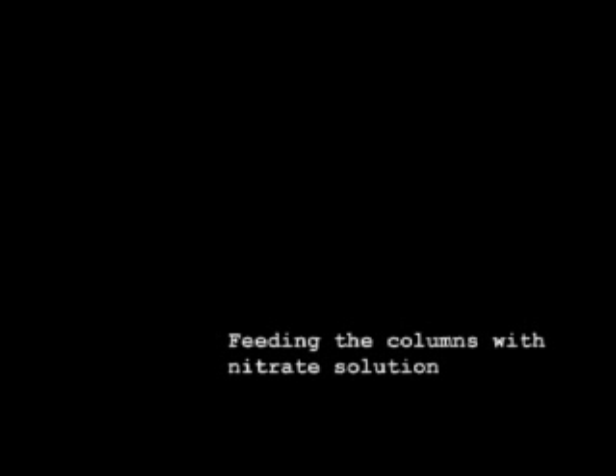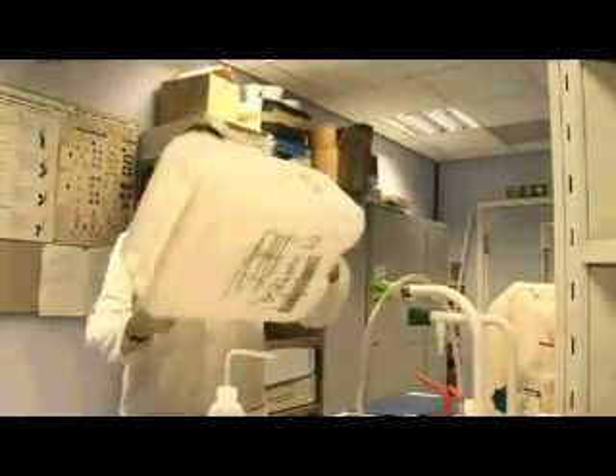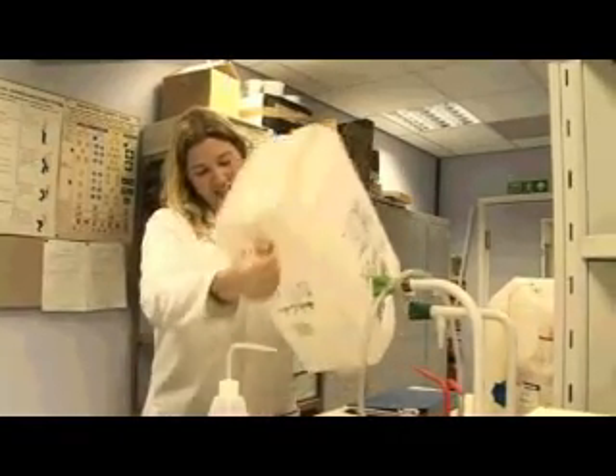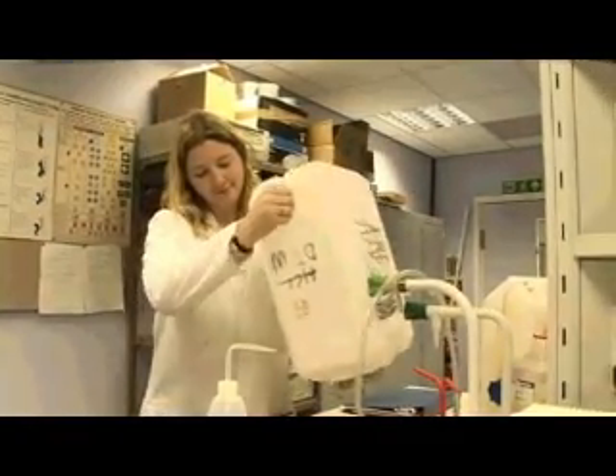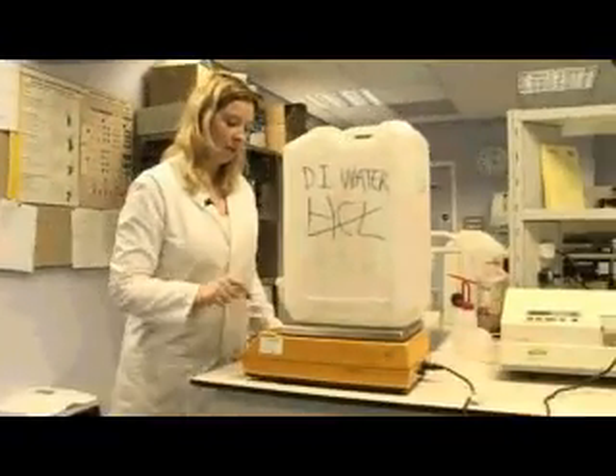I feed my columns and my tanks with nitrate solution at a particular concentration and I have to make it sometimes. So this is basically topping up my tanks. So I need to weigh out some nitrate.